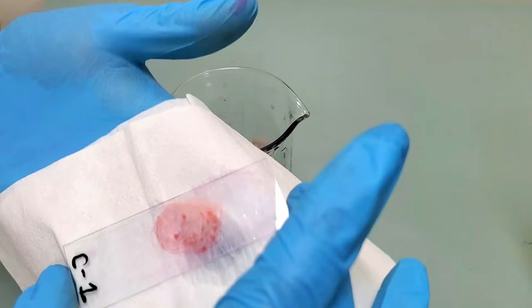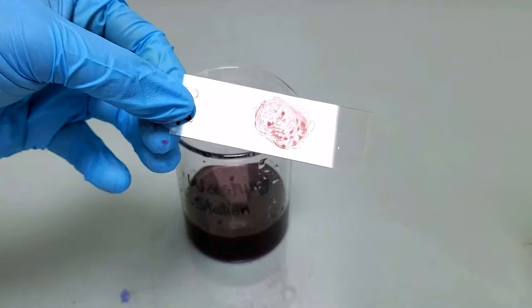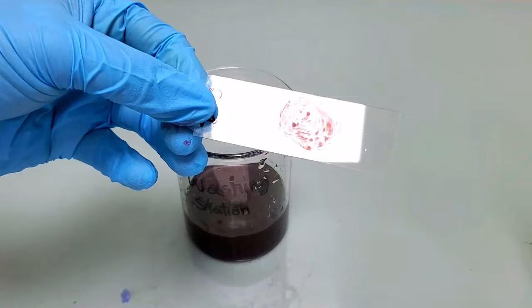Now keep the slide in the airflow for air drying of the smear. You can see that the slide is dried completely. This slide is now ready for microscopic observation.